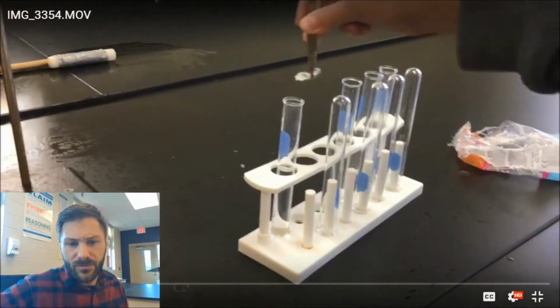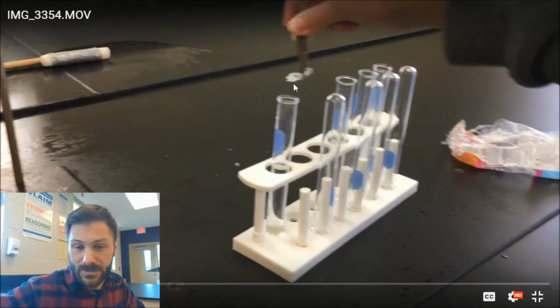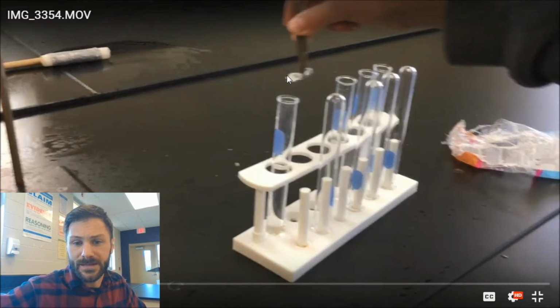we'll see here that in between these forceps we have a light gray, shiny, metallic, mossy zinc is what it's called. This is zinc. Element on the periodic table, number 30. The element symbol is capital Z, little n.